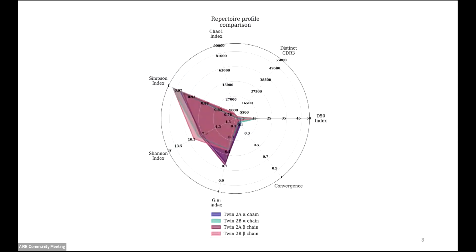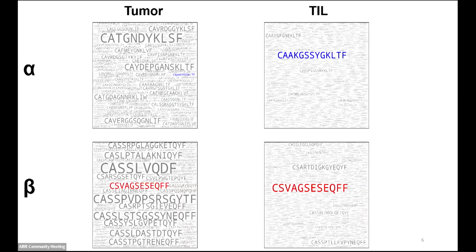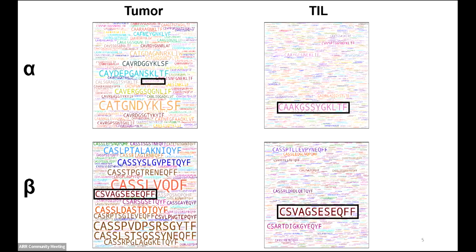Hi, can you go back to the slide where you were comparing different samples for analysis? The slide before that. I think one more, where you had those, exactly, this one. So the boxes over here, do they correspond? My question is, when you're comparing samples side by side, like when you're visually looking at it, you want to compare either the sequence or the color, right? So if it's abundant in one sample versus another, or if you're comparing different patients.